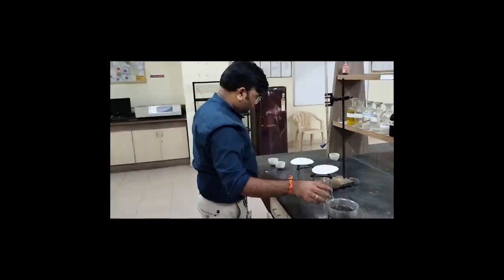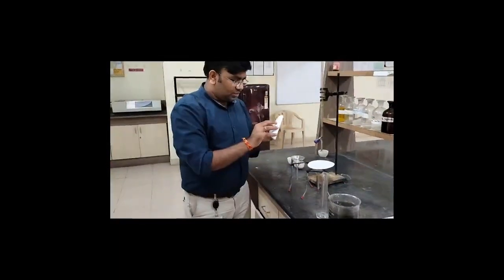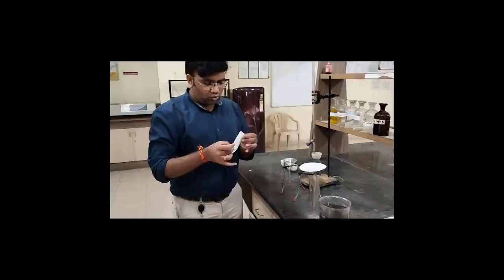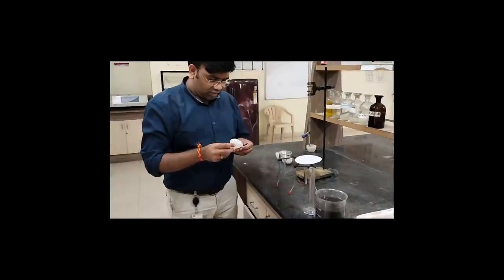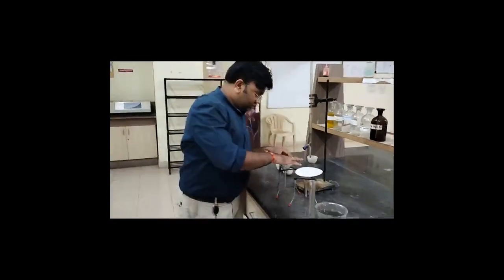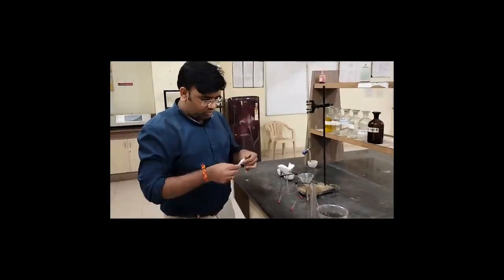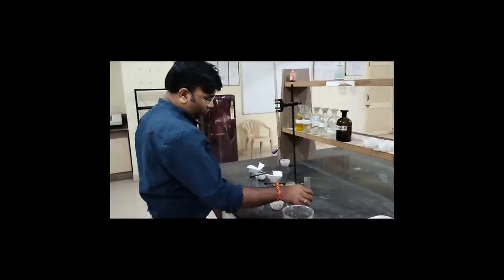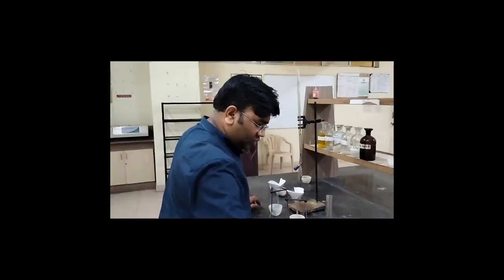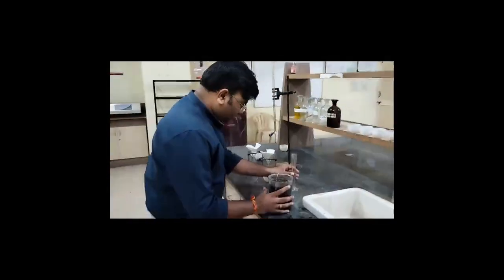Now what we are going to do next is pass the sample through this Whatman filter paper number 40, and then we are going to collect the filtrate. Right, so I made a fold, keeping it here. Crucibles 3 and 4 are the ones from which we are going to collect the filtrate. So again, stirring the sample, taking the 25 ml sample and passing it through this is going to be repeated.